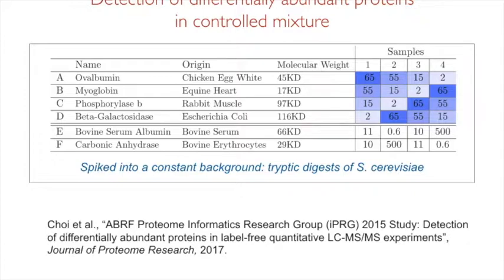And also, by the way, if you want to make this comparison, but either sample 1 or sample 2 is compromised, well, you still have the same comparison in different samples. So not only do you protect yourself against some interference at the protein level, but also against potential losses in the samples. This type of layout is well known in statistical experimental design, and it is actually used also in genomics and so on.